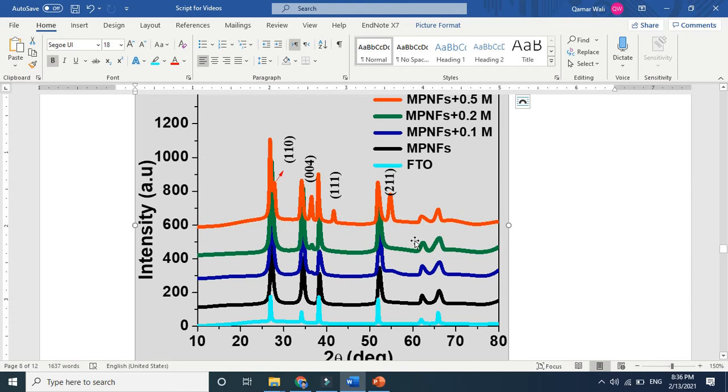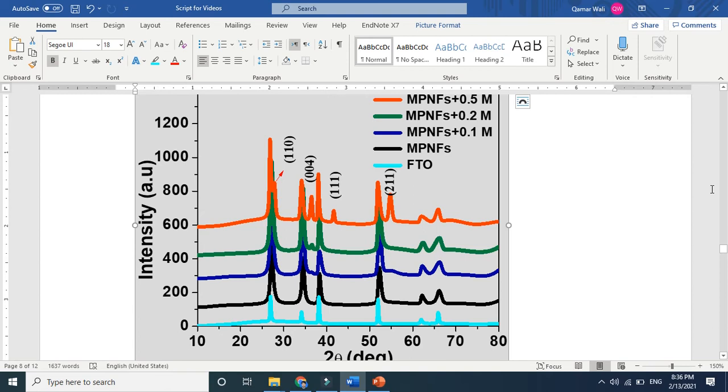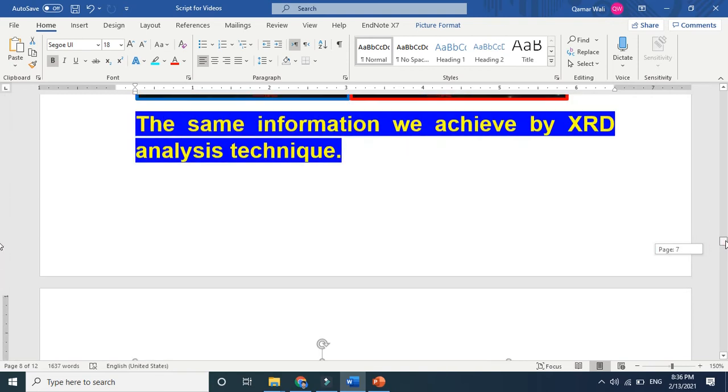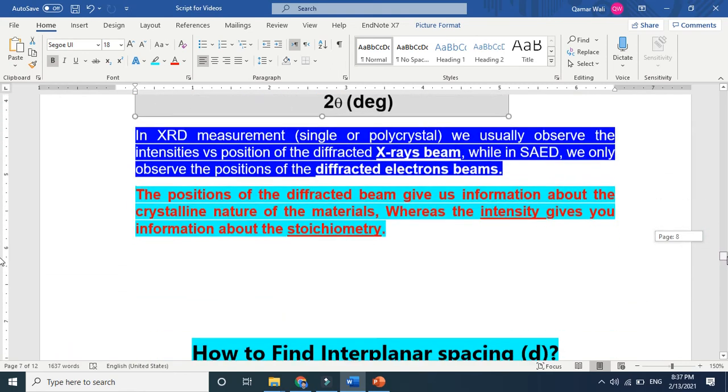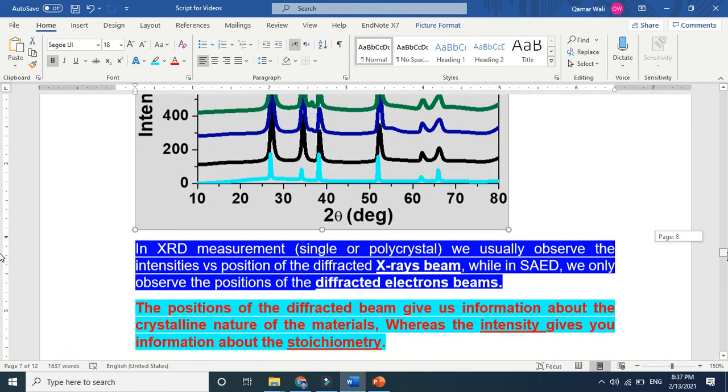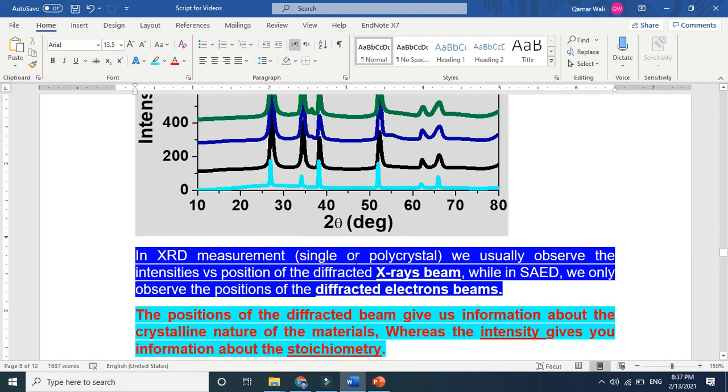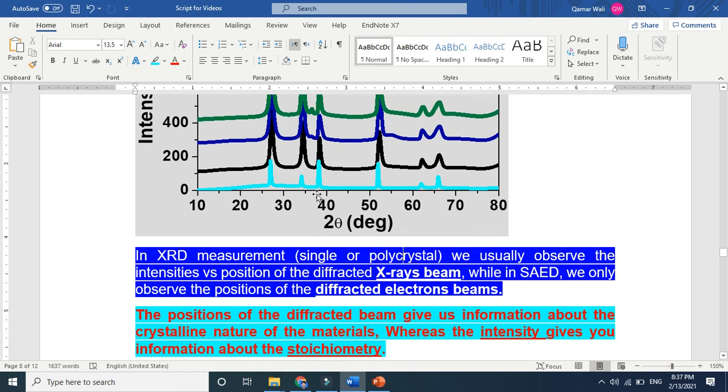So as we explained in our part of the video, XRD is basically tells about intensity versus position. This is the peak's position. In this one peak the ring is integrated there. For example, this is the polycrystalline. In this one peak 110. And if you look into this, so this ring is basically integrated in the peak. This is the only difference here. If you look here in XRD measurements, single or polycrystalline, we usually observe the intensity versus position. This is the position. The peak position is this, between the 20 and 30 theta. And here, this another peak is here. So it basically, the intensity versus position of the diffracted X-ray beam. While in SAED we only observe position of the diffracted beam.